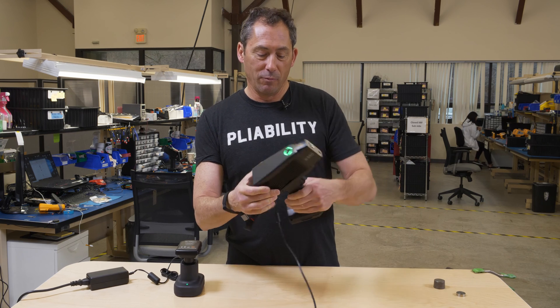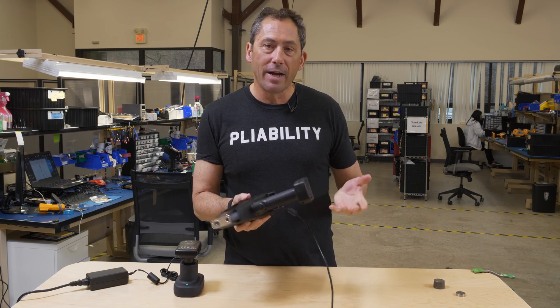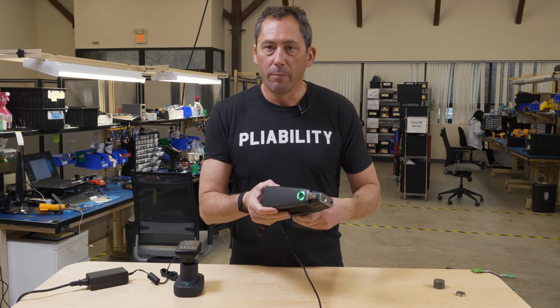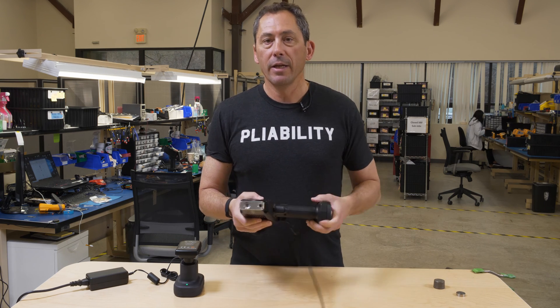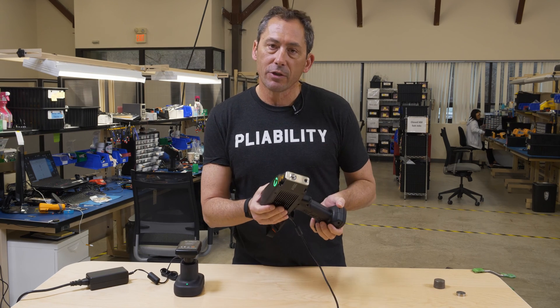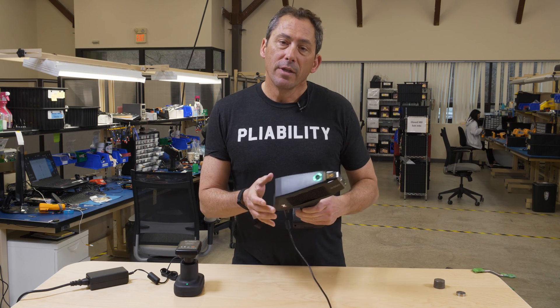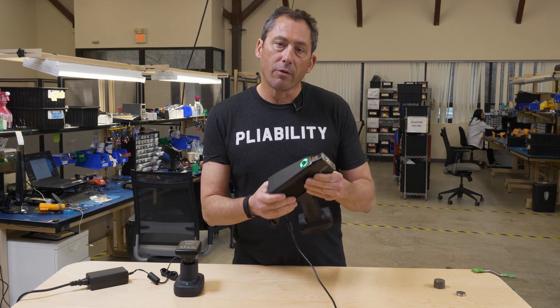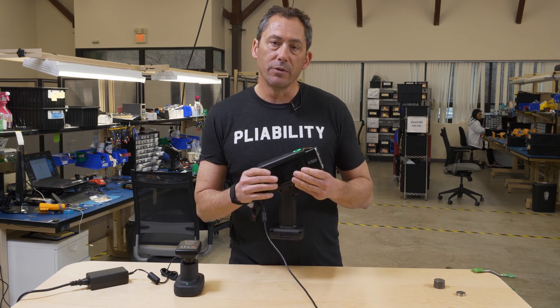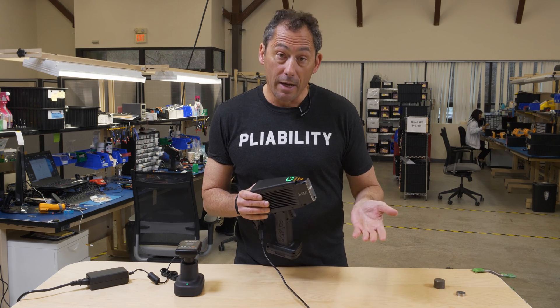Hi, I'm Don Sackett. I'm one of the founders and the CEO of CyApps, and we're at our factory here just north of Boston in Woburn. What we're doing is putting up some demos of our latest and greatest x-ray analyzer and LIBS analyzer. Because of the current public health crisis, a lot of our customers can't accept visitors or can't travel.